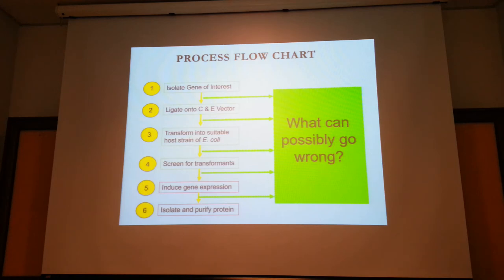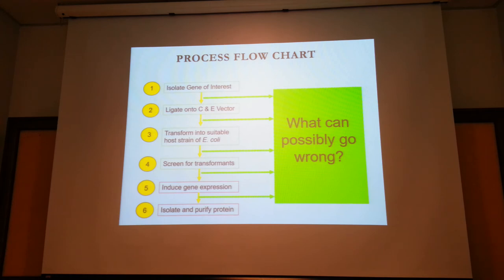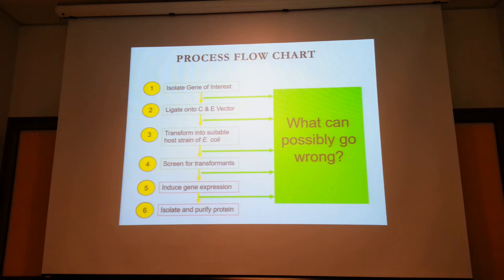To recap the process flow chart: you first isolate your gene of interest, secondly ligate onto the cloning/expression vector, transform, screen, induce gene expression, and purify your protein. At every stage things can go wrong. When you isolate your gene of interest, it may be incompatible with E. coli. Sometimes the RNA transcript produced by the gene of interest in E. coli may downregulate certain processes. Sometimes they may have palindromic sequences so your RNA transcript folds on itself due to complementarity between the 5' and 3' ends, preventing protein expression.